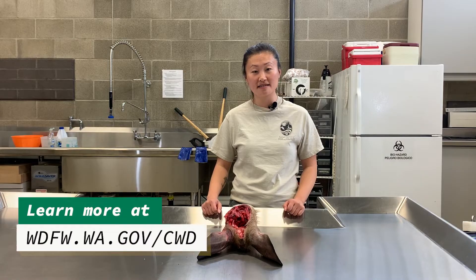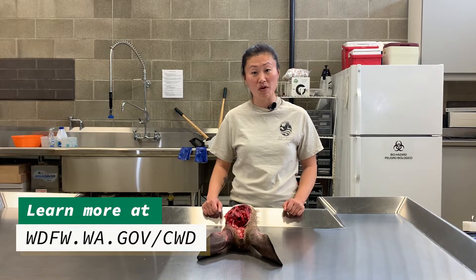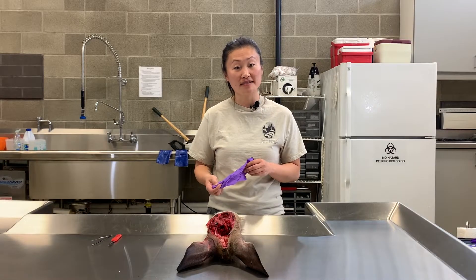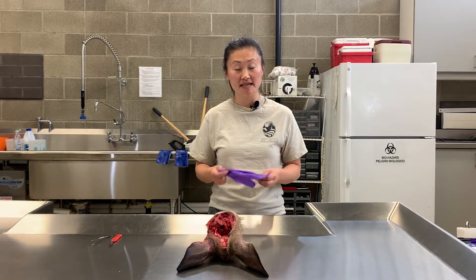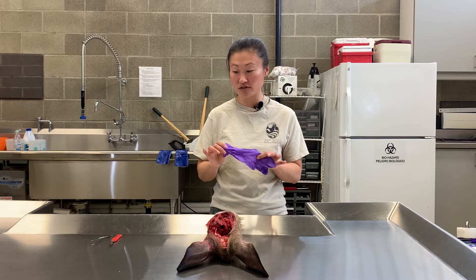CWD is a prion disease of deer, elk, moose, and caribou. To learn more about CWD, you can visit our WDFW website. Anytime you're field processing or taking a CWD sample, we highly recommend wearing some sort of glove to protect yourself.